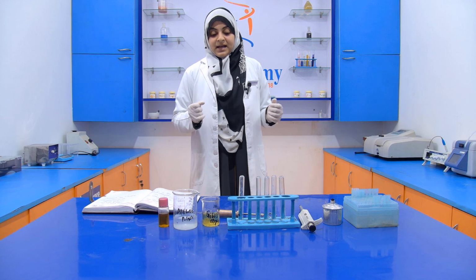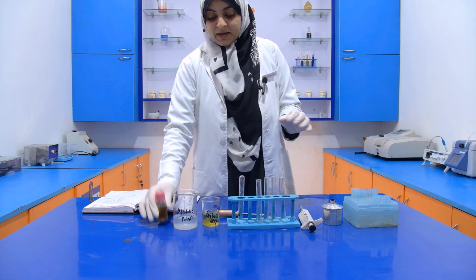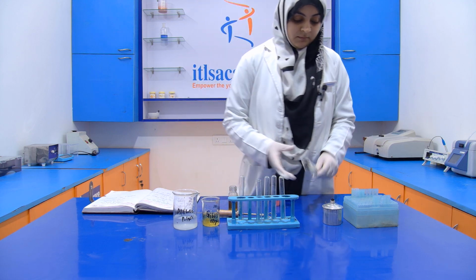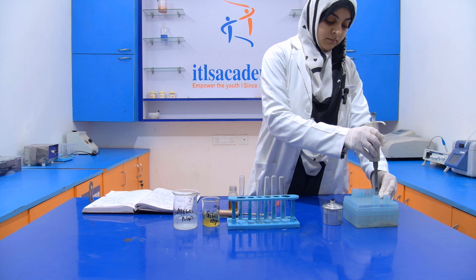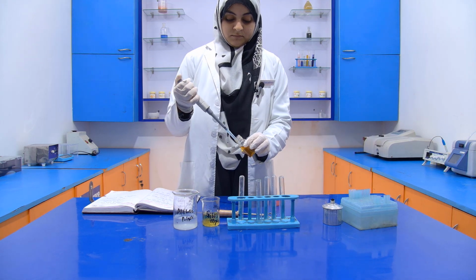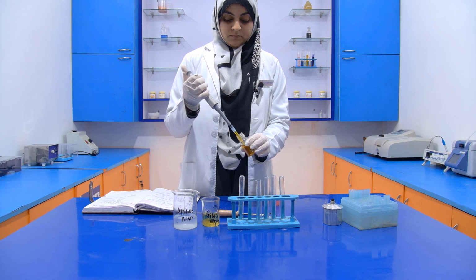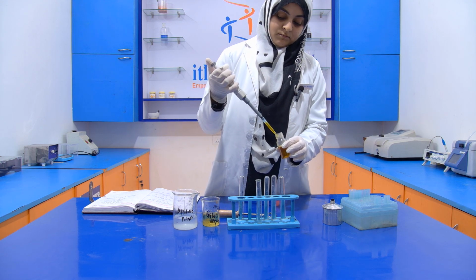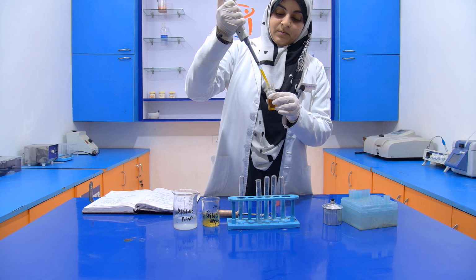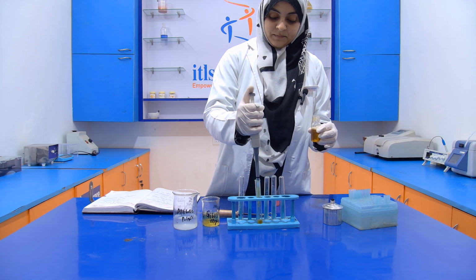So let's start the experiment. First of all, take a test tube. Then we have to take 2 ml of oil. We have to avoid bubble formation, okay? Because if bubbles are formed, then error will occur.